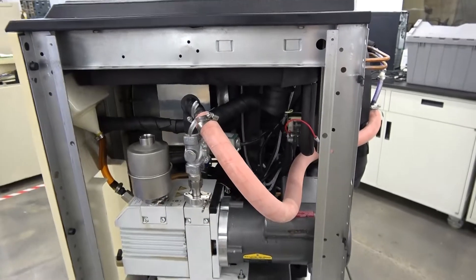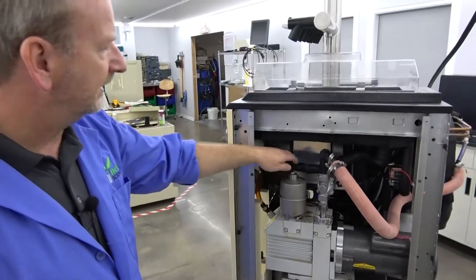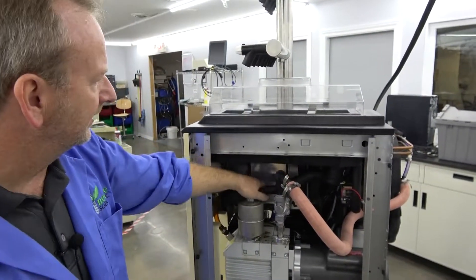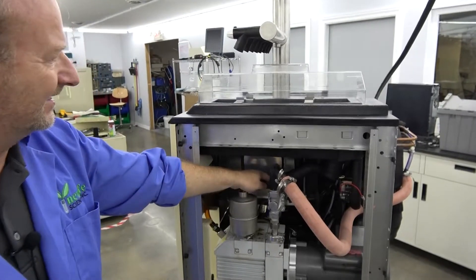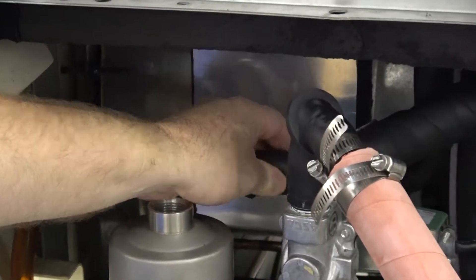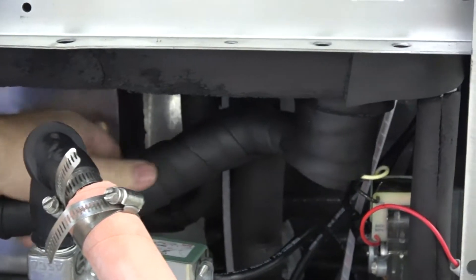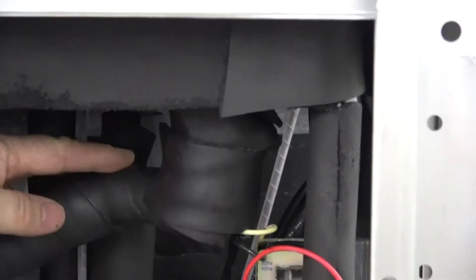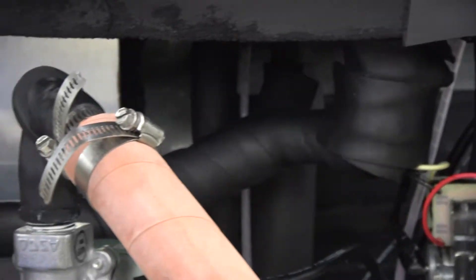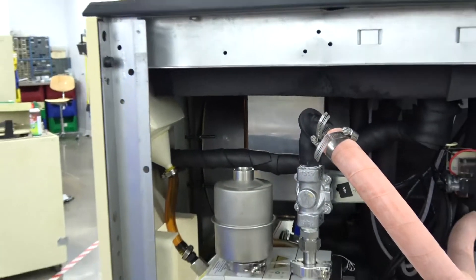I've had this in here for about a week going through it. Another thing we did — a lot of times in refrigeration systems, all the insulation that keeps the condensation from dripping all over the equipment can lose its integrity over time. So we also went in and rewrapped a lot of the lines with insulation, and that keeps the condensation from dripping all over underneath the machine.